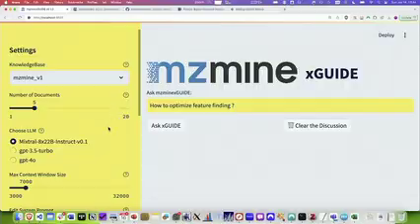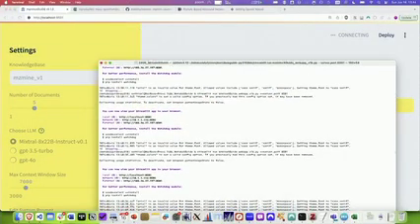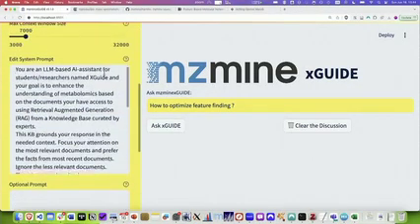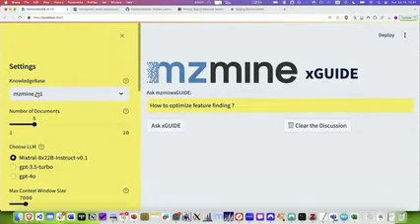Okay. So I will just restart everything. It's running on my computer at the moment, but it will be soon available online. Okay, I need to check this.